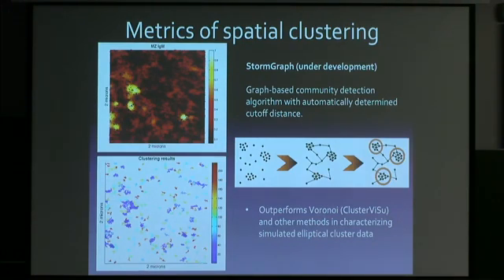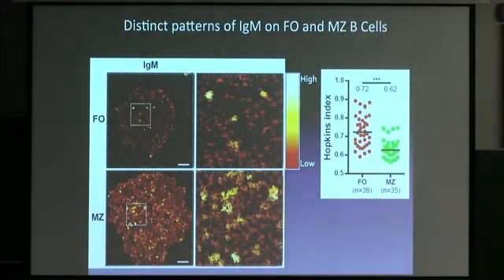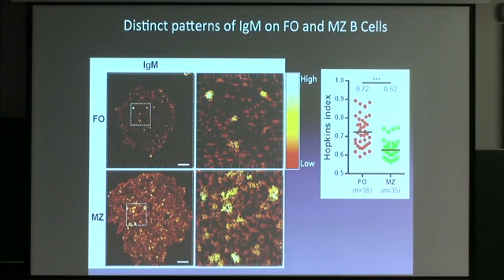What is the goal in identifying the cluster? I want to know how big they are, how many there are, and how many dots, how many antibodies are in each cluster. That's what I want to know. It's like I discovered a new animal, right? Start off by measuring weight, height, all these kinds of characteristics.